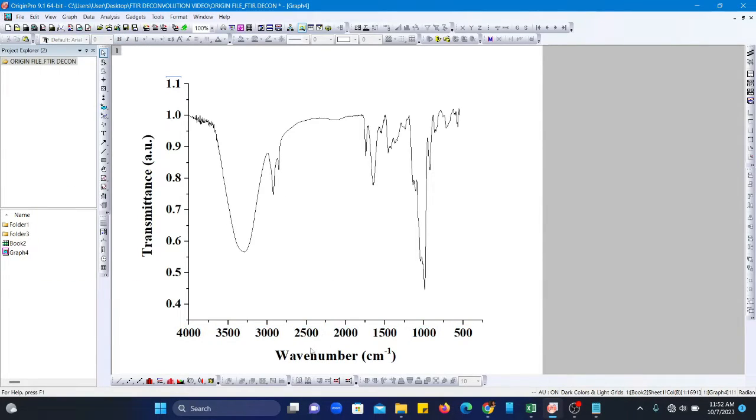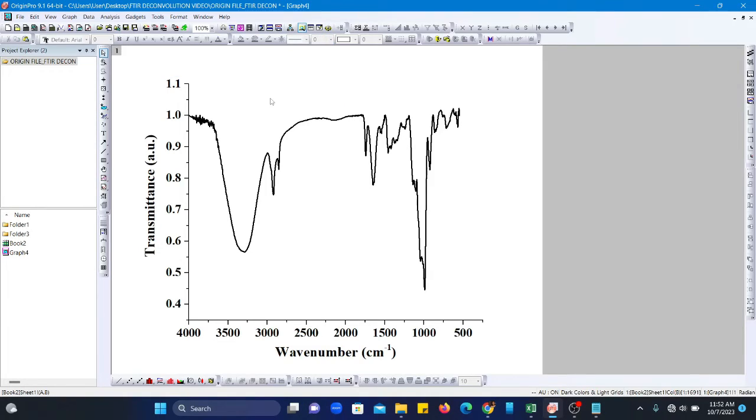So everything should be uniform and consistent, even if it's font size or font style. Now you can see this graph is looking like the line is very thin, right? So you can also increase the width of this particular graph. Go here and select 2. Okay, now it's pretty much visible.